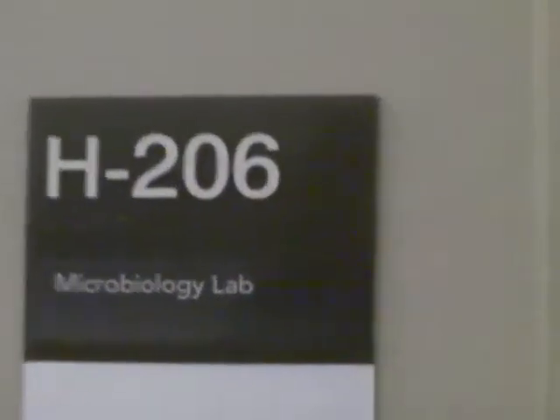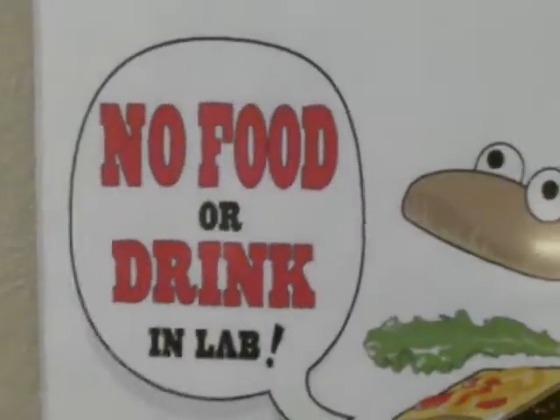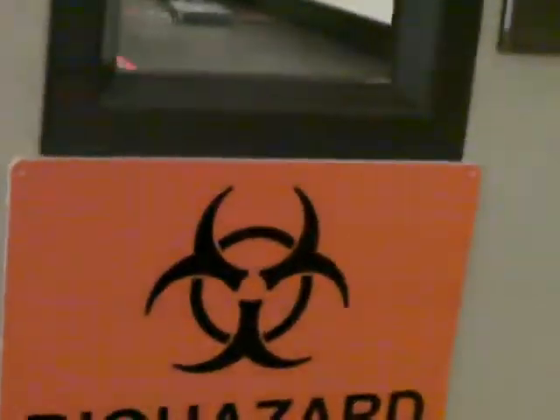Here we are in building H, on the upper level floor. This is room H206, which is going to be your microbiology lab. As you can see, there are some guidelines posted: no food or drinks allowed, biohazard, and so on. There are going to be two doors to the lab — let's come in and see what you find when you come in.